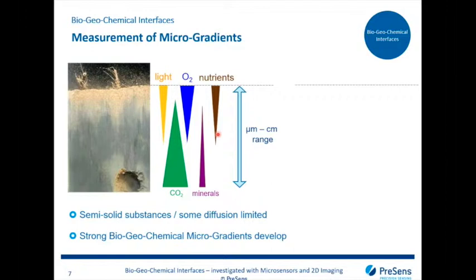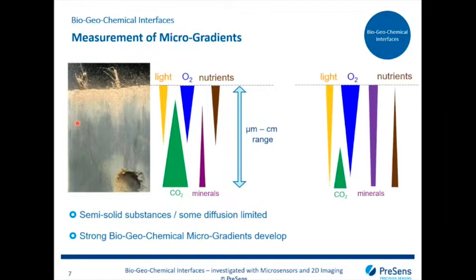And as we're talking about complex heterogeneous systems, these gradients usually don't stay constant. They vary spatially, for example from the lower zones of the sediment to the upper zones or from left to right, but they also vary temporally quite strongly, for example in day and night cycles or over the year, or due to changes of any kind of fluid mechanics, which we can see here.